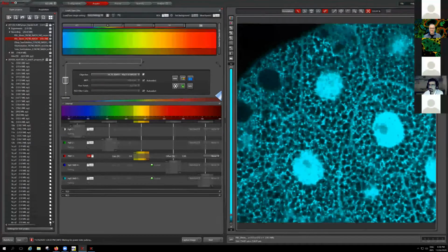Yes. It was just the point that we discussed earlier with Stefan. For example, one control measurement is, well, you basically can't have any living tissue you can deplete of NADH or FAD or anything like this. What could be controlled is actually something like the little test experiment that we ran, where you try to manipulate the metabolism, hopefully in a well predictable way.